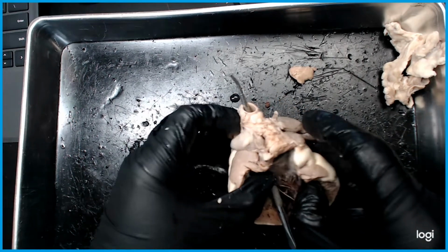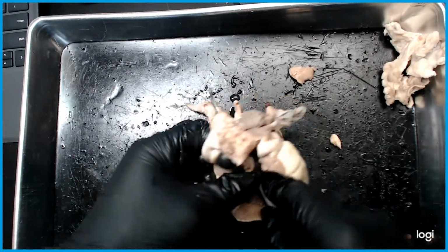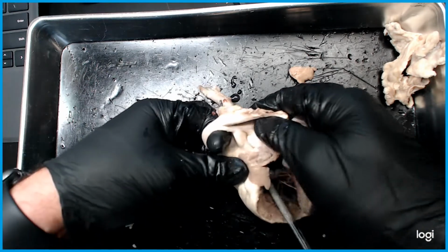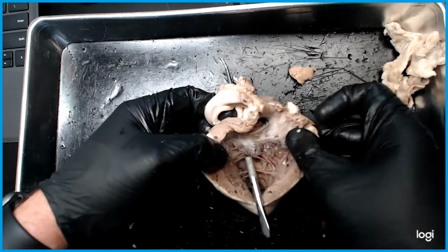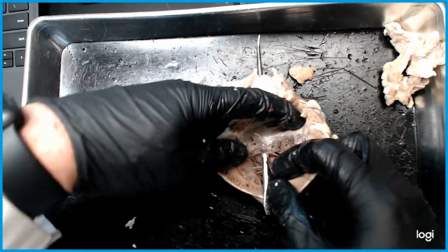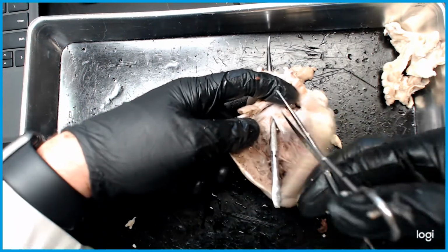So now we have to find that. Now keep in mind that when we were working on this side, we saw some of these blood vessels, so we're going to try to stay away from those. If we have to, we can somewhat separate as best as we can. If not, we're going to end up going right through them. Okay? So this is what we have. We're going to continue through there. We're going to use a probe as a guide to make sure we're not cutting into anything else that we're not supposed to. We don't want to go past it. So now that's the first separation.